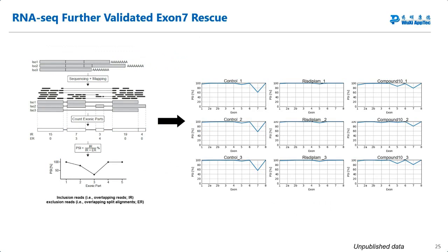Our DAL screening thus identified a small molecule that binds to SMN2 exon 7 and can regulate exon 7 splicing, with the potential to treat SMA. However, we also care about whether this compound is specific to SMN2. We performed an RNA-seq experiment to check genome-wide gene regulation. Risdiplam was used in parallel as a control. We wish not to see too many differences in terms of gene regulation as compared to this positive compound risdiplam.